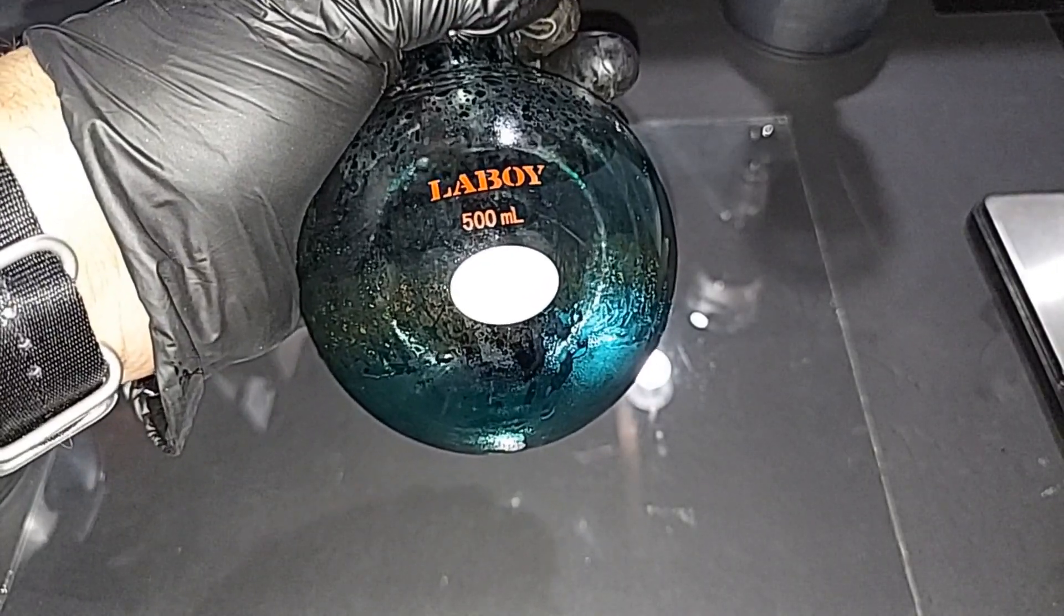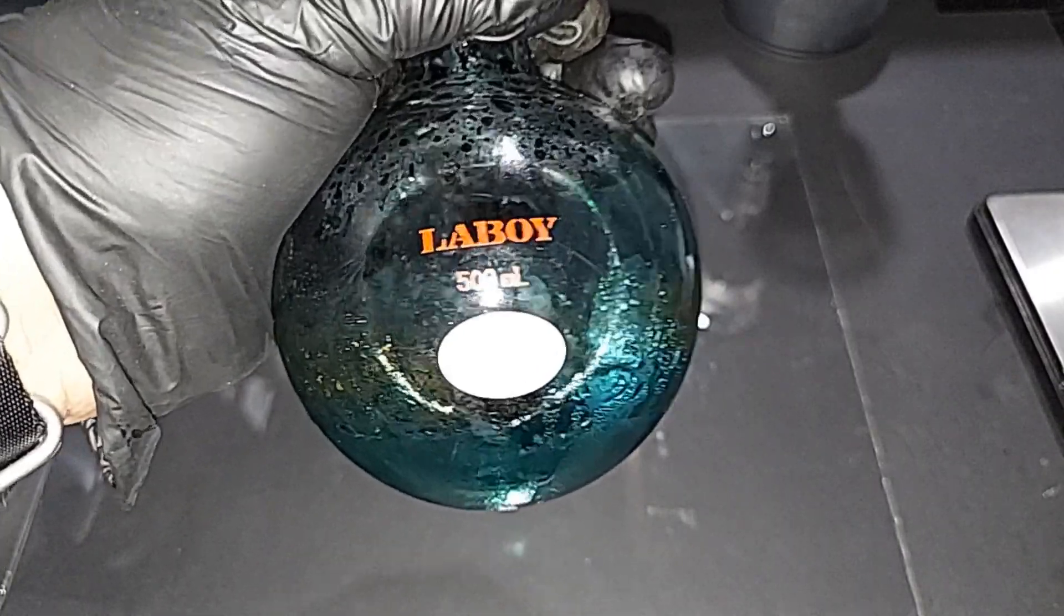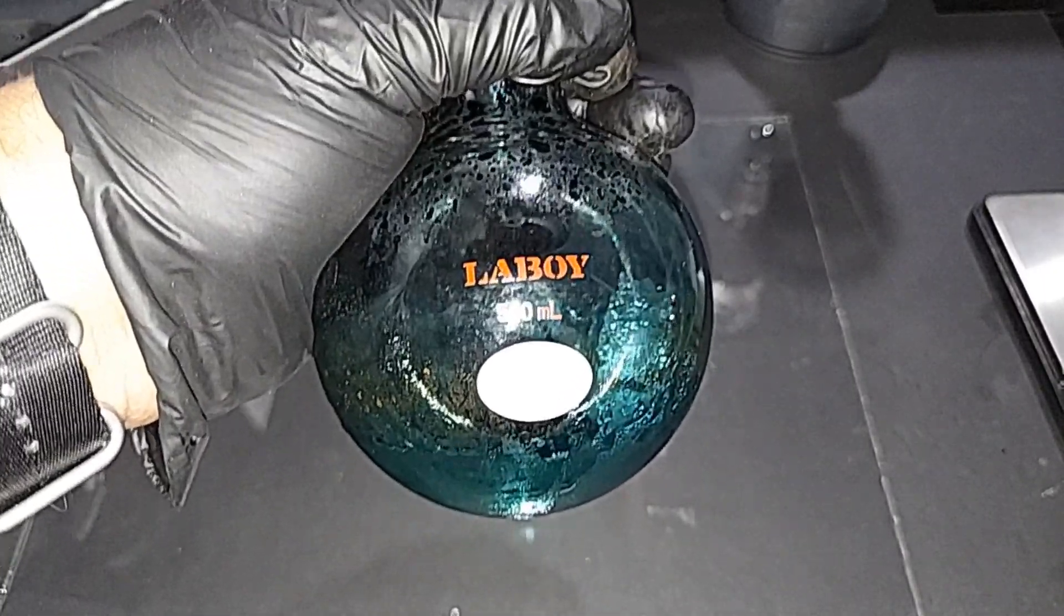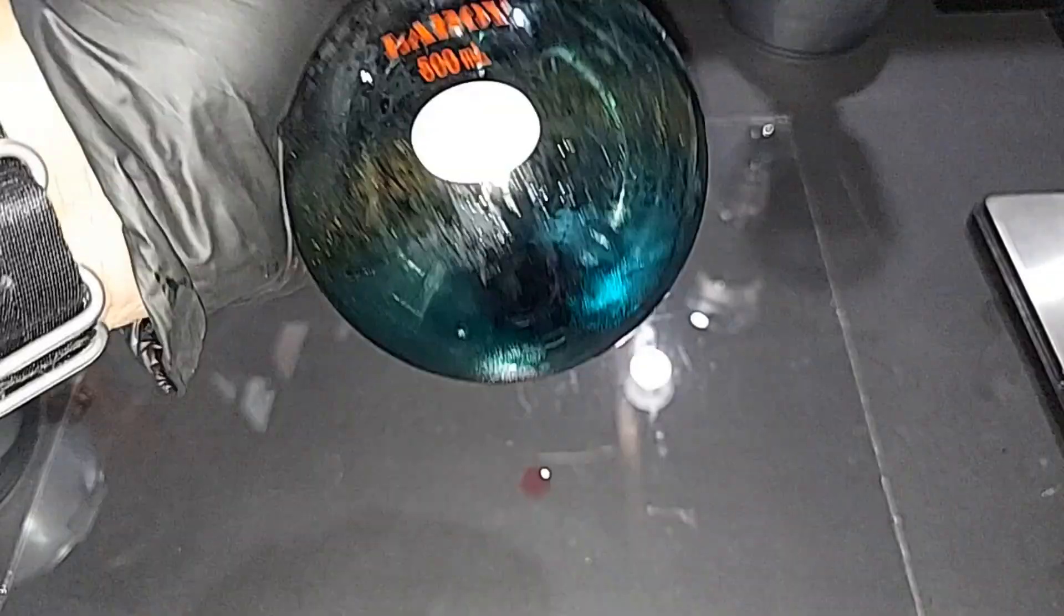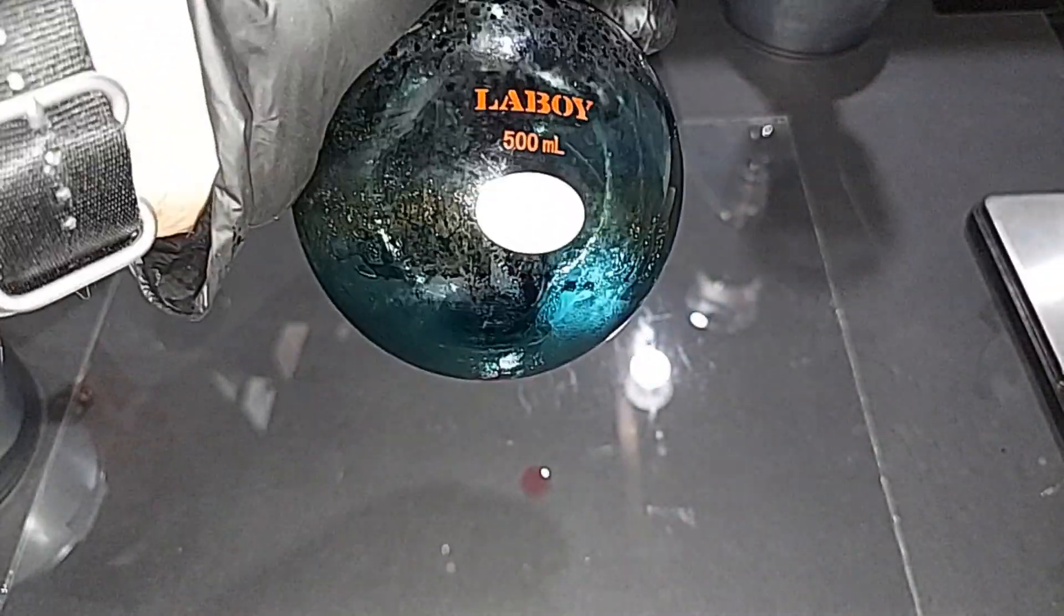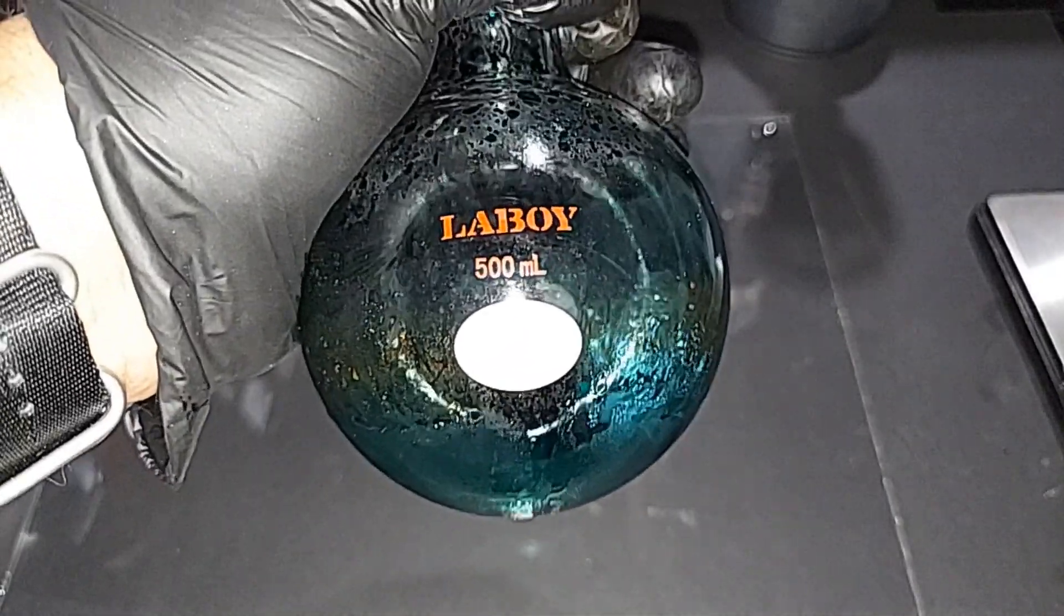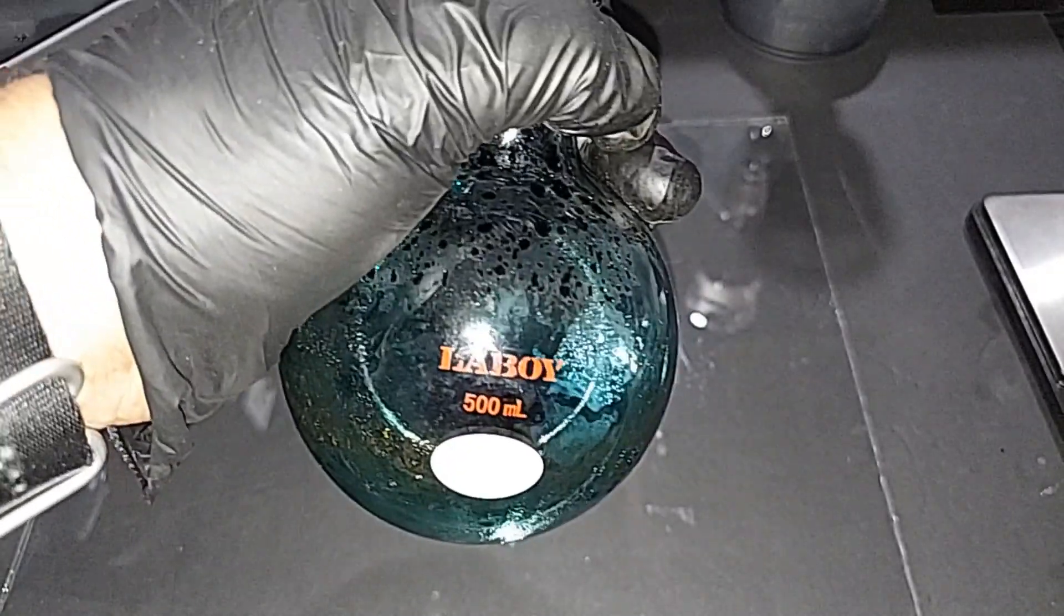When we just filtered the solution out of the freezer, this is what I used, this round-bottom flask, to collect the filtrate. I just wanted to show you how green it is, just once again to show that the manganate goes through the filter while the potassium permanganate comes out of solution first.